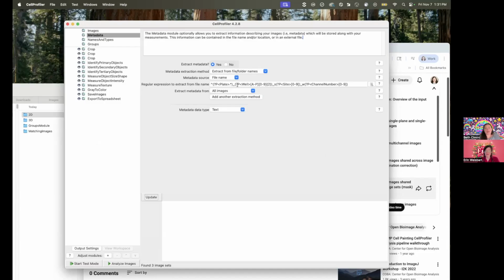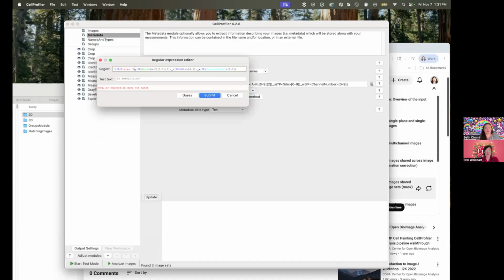But if I had done this, I can just write a quick regular expression here, and say that this goes, and I wasn't born knowing how to do this. It just took a little bit of time to figure out. But you too can eventually, even if you've not taken professional coding classes or anything, learn how to do this.